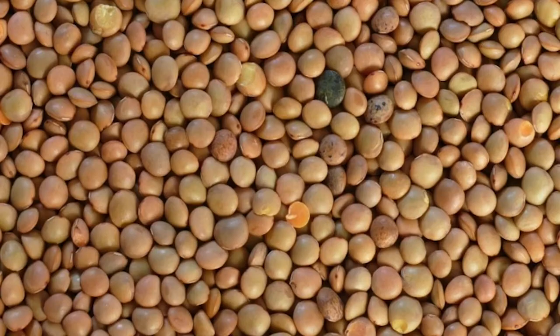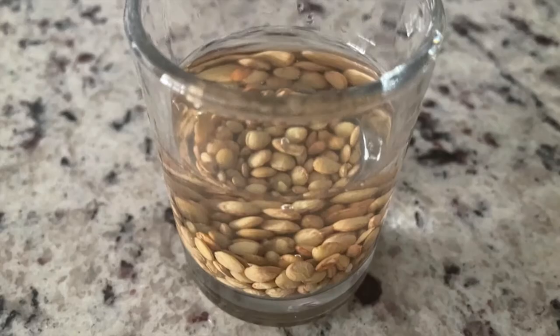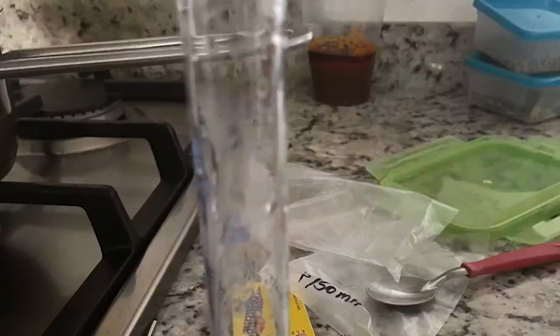In this video, I explain how I carry out the in vitro germination of lentil seeds. Seeds were left in water 6 hours before starting. Then, they were put in another container. To this, 1% sodium hypochlorite was added. For this, Clorox was used.